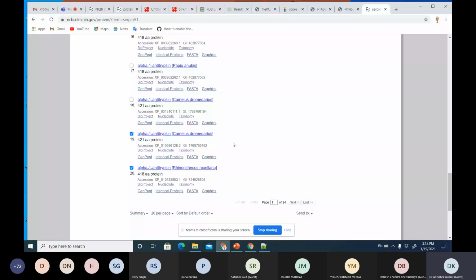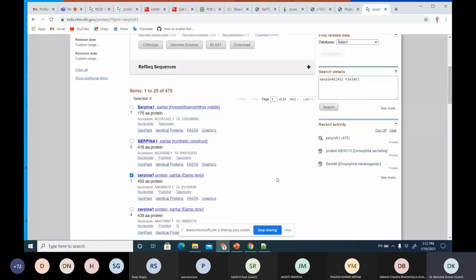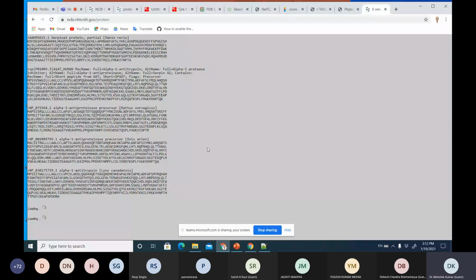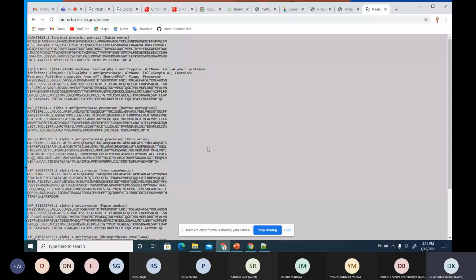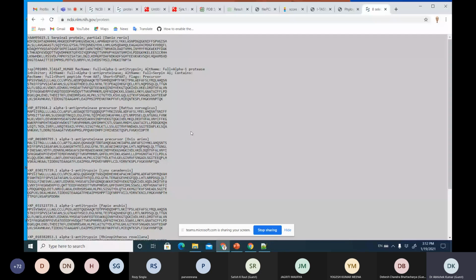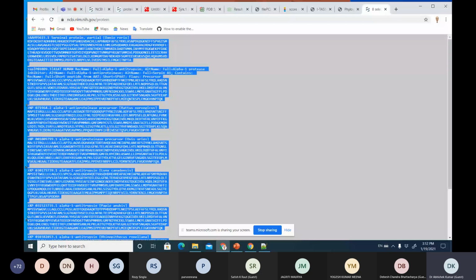Now this can be downloaded as FASTA text. Easily from NCBI one can download, as you see. And now this is the sequence which we have. When you are seeing a FASTA as an example, you see how long the code can be, starting with the greater than sign. So this goes for several lines, but they are all together in a single straight line.